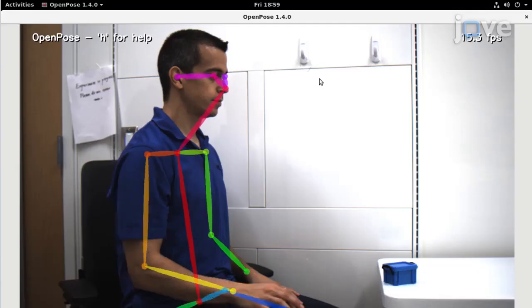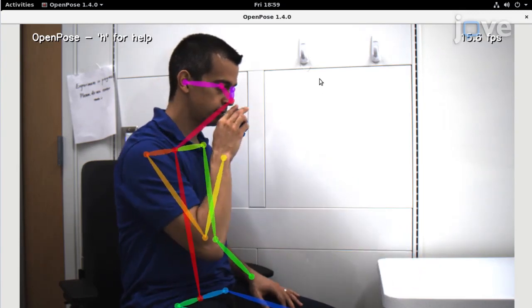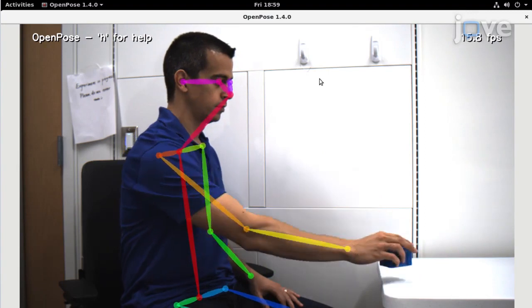Recent developments in deep learning, a branch of machine learning and artificial intelligence fields, provide opportunities for automated and objective quantification of images and videos. Here, we present our recently developed methods utilizing deep neural networks to perform detailed behavior analysis in rodents and humans.